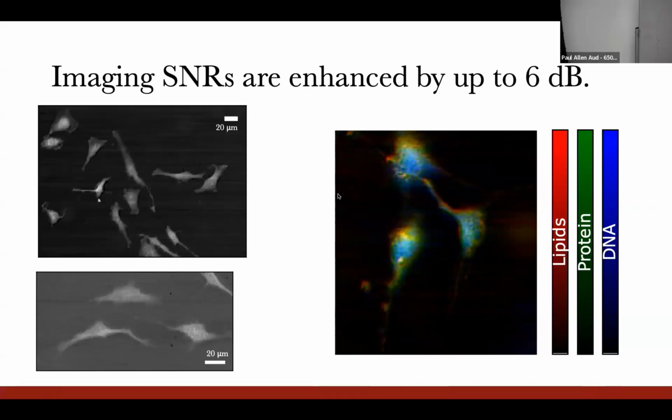And these enhancements are just far outperforming the near-term prospects for squeezed light sensitivity in these kind of Raman microscopes that can take cell images on the order of about a minute or so. So we think these cavities are really promising for enhancing the sensitivity in bioimaging in this regard.